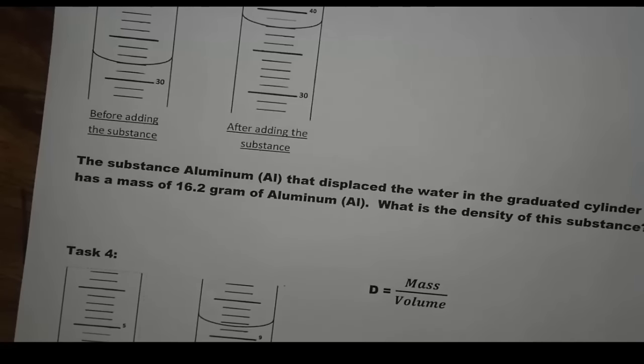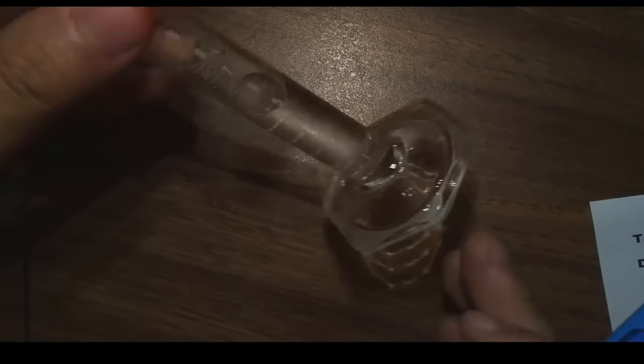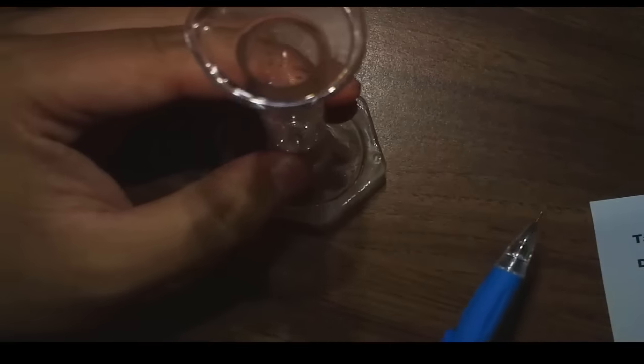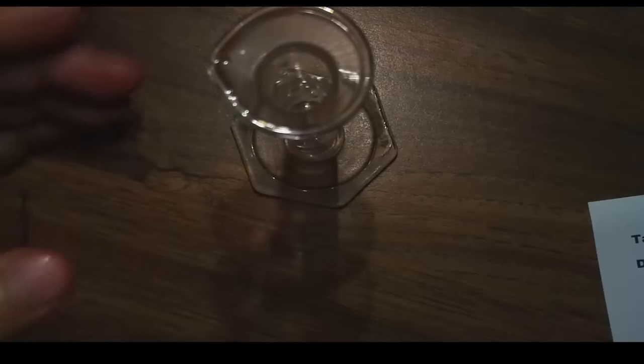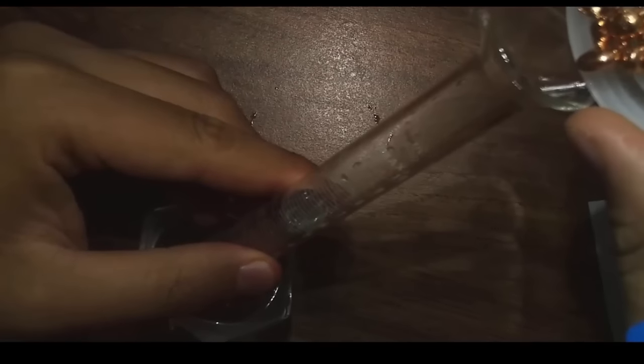Before we move on, let's look at a specific example. In this case, I have a 10 milliliter graduated cylinder. Notice how there is no substance here, and the reading is about 5 right there. You can see that, right? So in this case, I don't have aluminum, but I have copper. Look what happened when I added in the copper. You can see that it is increasing the volume.